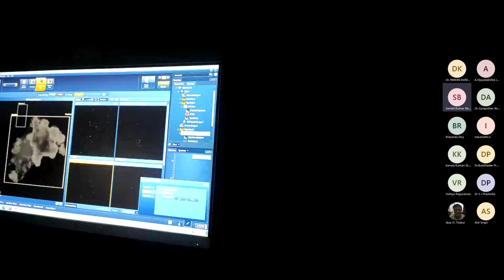What do you understand about the TEM facility? So you can go to the TEM site and book your slot using the site, and you can take your sample for your research also, obviously. So this is one piece of information I want to tell you.